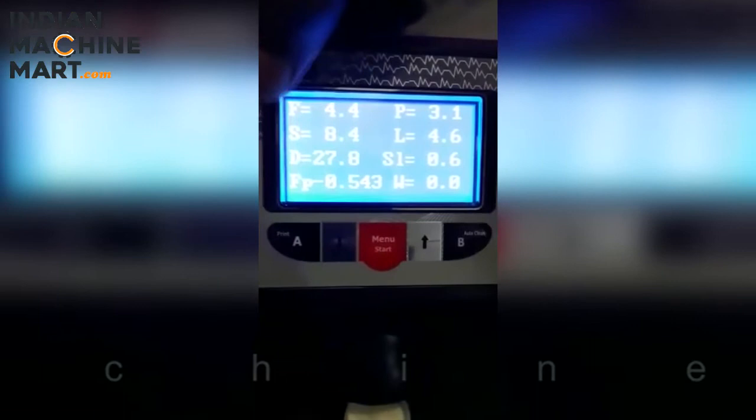Here is your reading: fat 4.4, SNF 8.4, density, freezing point, protein, lactose, salt, and water. This is how you can test with this machine.